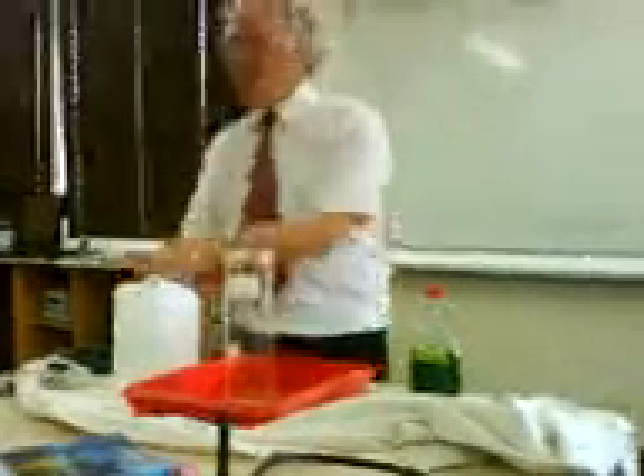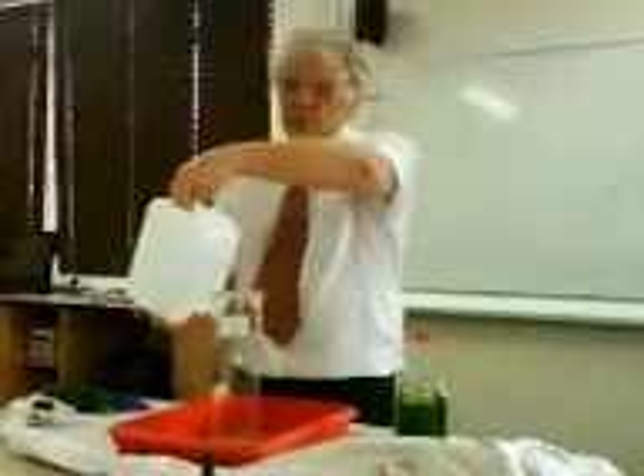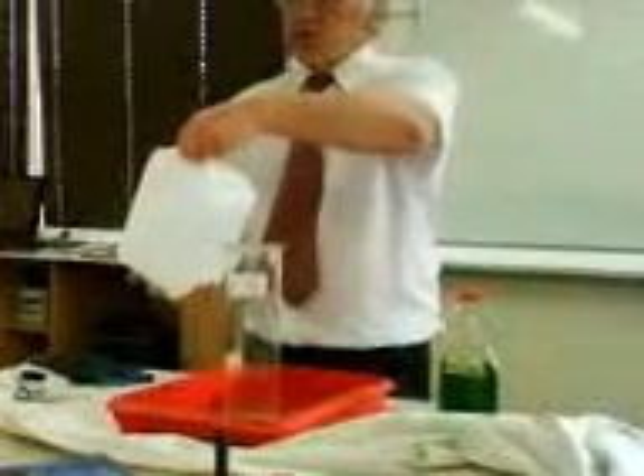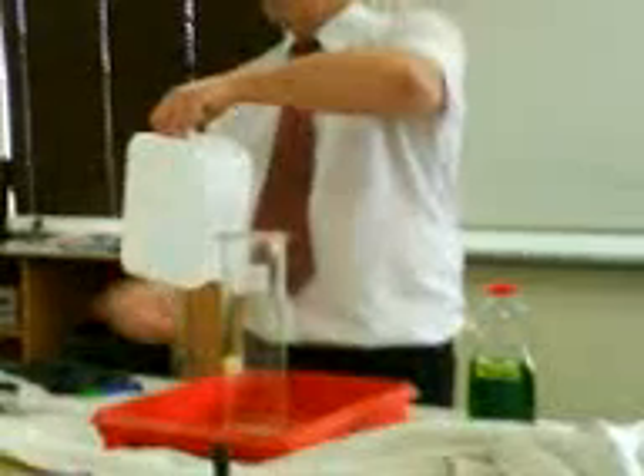Okay, this is some high-concentration hydrogen peroxide, and we've had this for a long, long time — it's not decomposing. 100 volumes — one volume of this produces 100 volumes of oxygen. Therefore, it's a good job it's not decomposing, otherwise the container would be blown.